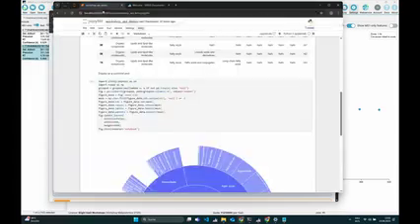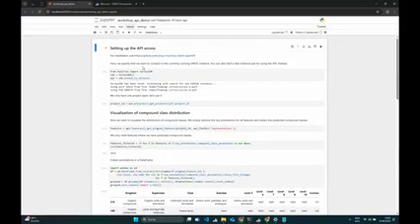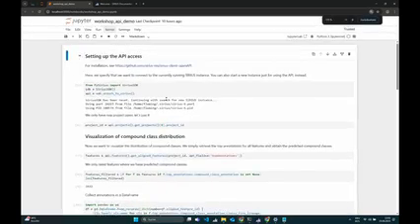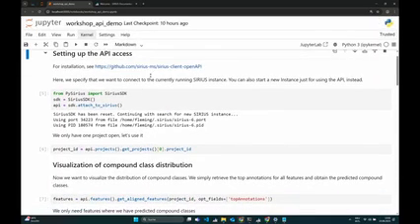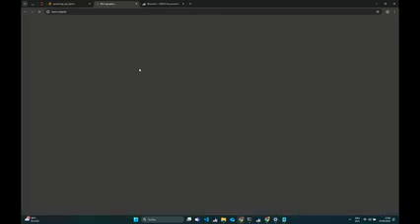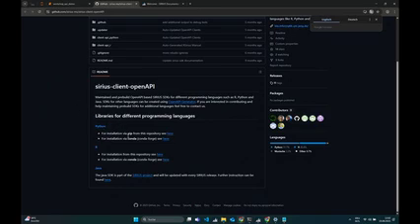It is now actually quite easy to just access the API. So what I do in this example is I have just started a SIRIUS instance. Ah, yeah, yeah, I can zoom in, of course. Yeah, it's a little bit small. But this is now just a Python notebook of Python code. If you click on the first link, I hope this opens a second tab. Yeah, there's also here a link to the GitHub and instructions how to get the API installed for R, for example. But now let's go back.